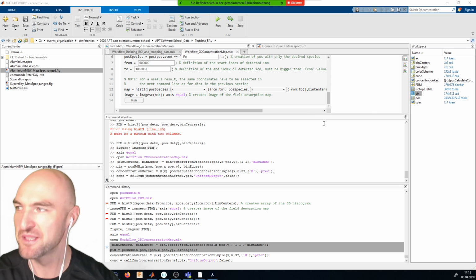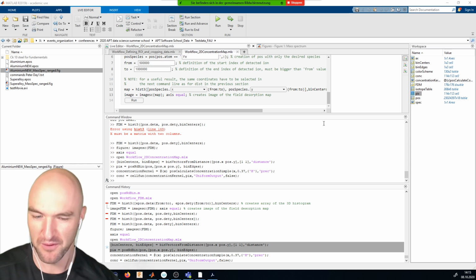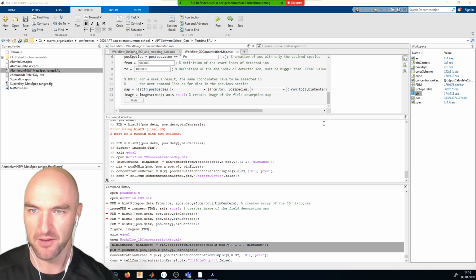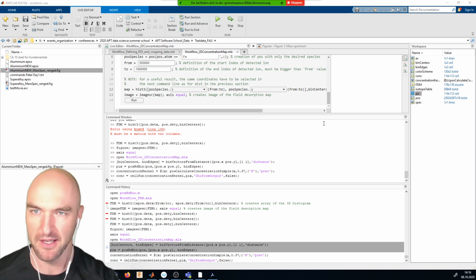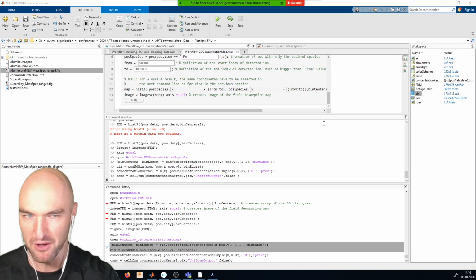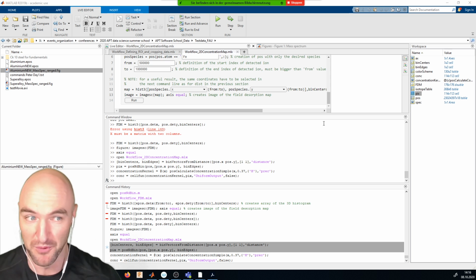So yeah, we're always open for interesting suggestions. But I think the transfer function thing is absolutely not helpful. It's computationally much cheaper, because you just need to say, okay, I put some kind of function here and blur everything. But it's not a clean solution, because you wanted to make things independent of the grid, but then you create a dependency on a user input. So that's even worse.